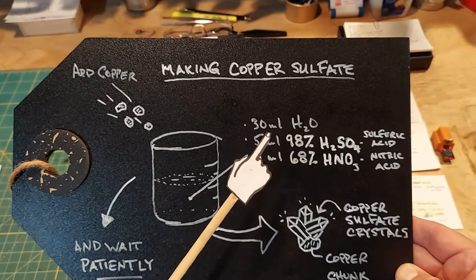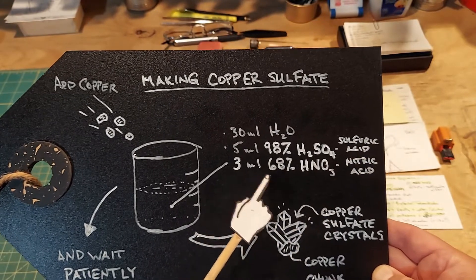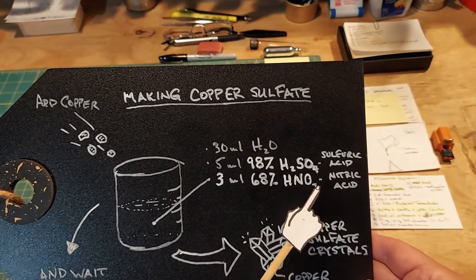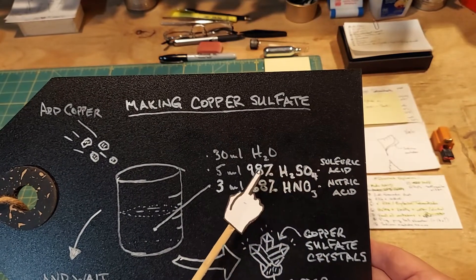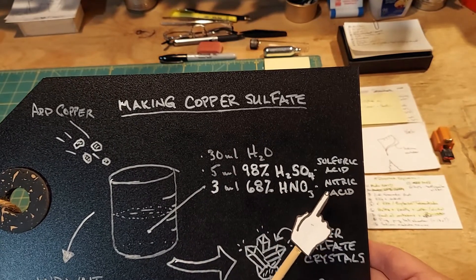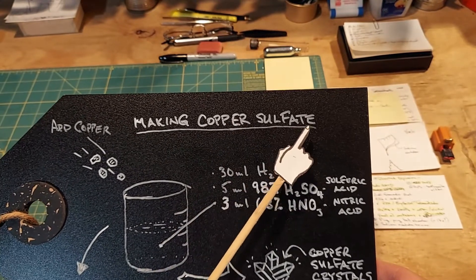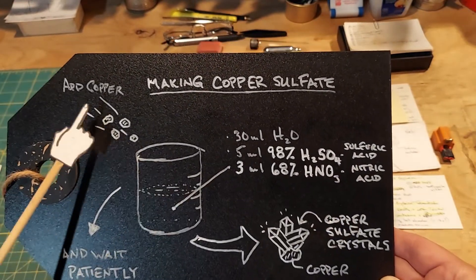In a beaker we're going to have 30 mls of distilled water. We're going to put 5 mls of 98% H2SO4 sulfuric acid and 3 mls of 68% HNO3 nitric acid. Sulfuric acid and nitric acid are commonly used in combination — sulfuric acid is a great astringent, it soaks up water during the reaction, and nitric acid is used to encourage the sulfur from the sulfuric acid to attach to the copper, making copper sulfate. The sulfur comes from the S in H2SO4.